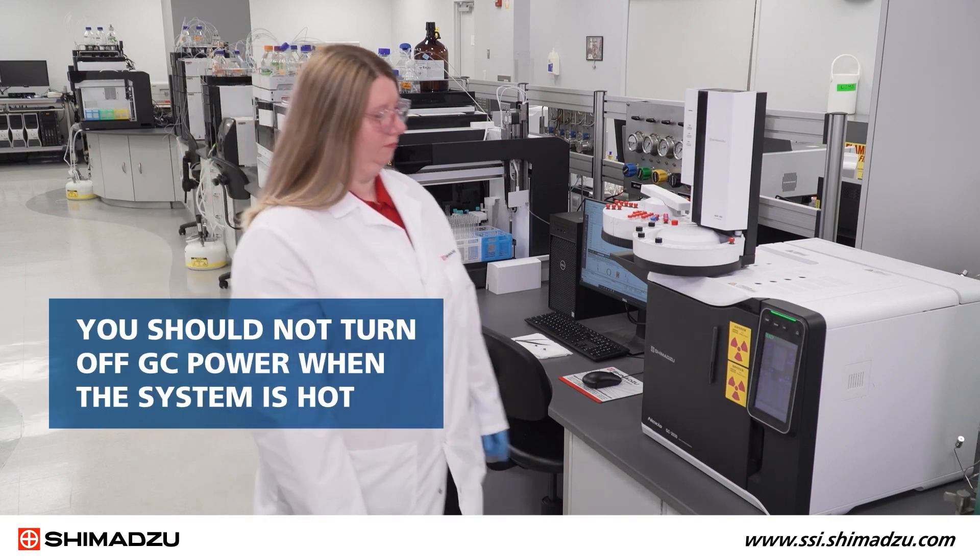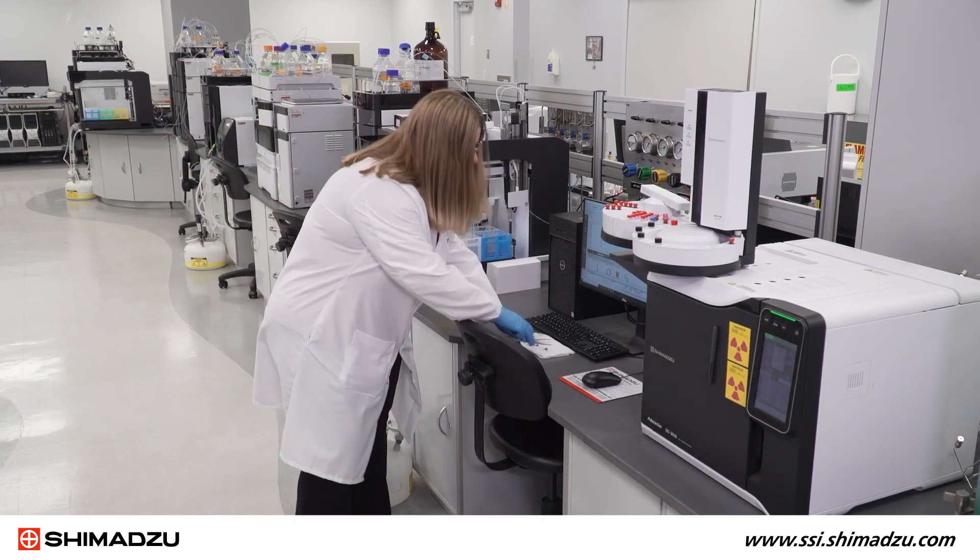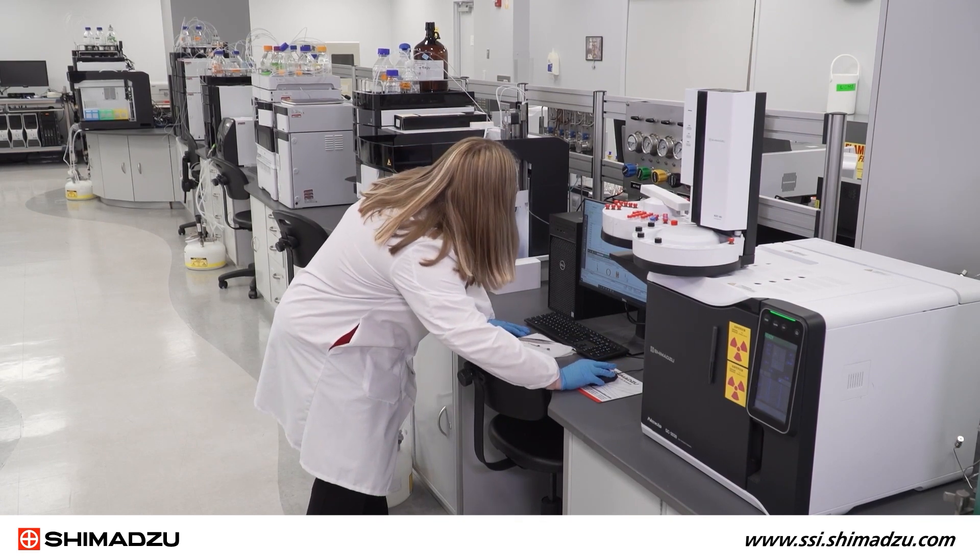First of all, it's important to note that you should not turn off GC power when the system is hot. First, turn off the heat control to cool down the oven and other modules.